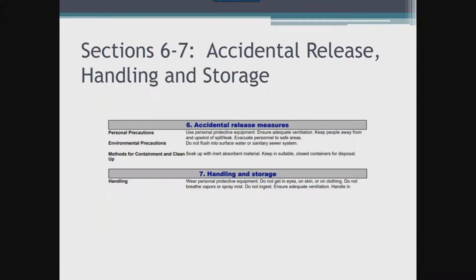If NA is listed on the safety data sheet, as is for physical hazards, the spot is left blank. So on to section 6, which provides recommendations in response to spills, leaks, or releases, including containment and cleanup practices to prevent or minimize exposure.